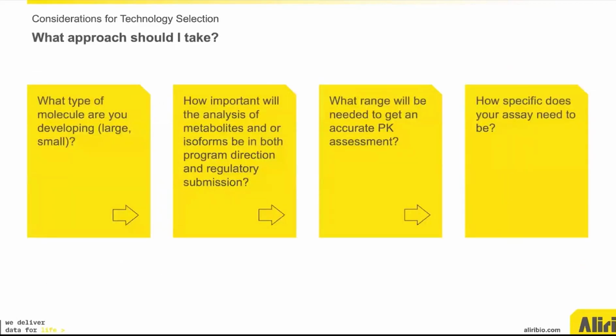So what approach should you take? LCMS has timing advantages for tox studies with high LLOQs, since you will likely not require a critical reagent for capture. For a PK study with low LLOQ needs, a hybrid approach using a generic antibody can save time and achieve meaningful detection limits. If high specificity, multiplexing, and a wide dynamic range are important, LCMS or hybrid LCMS is an excellent tool to monitor and quantitate multiple analytes in a single analytical run.